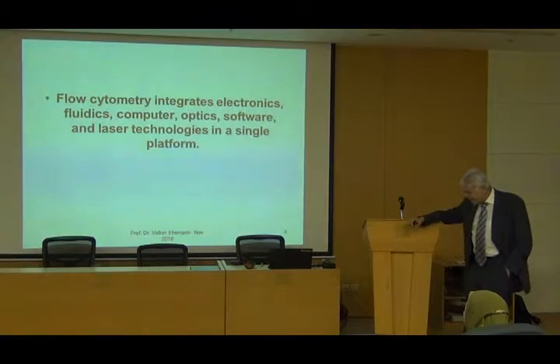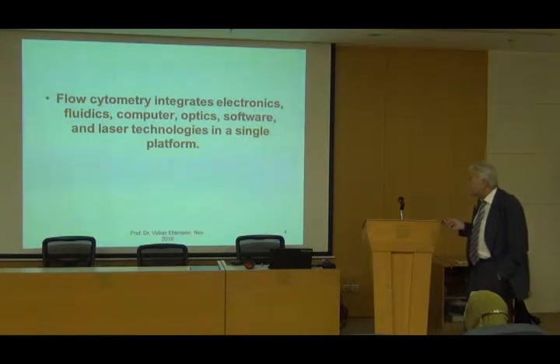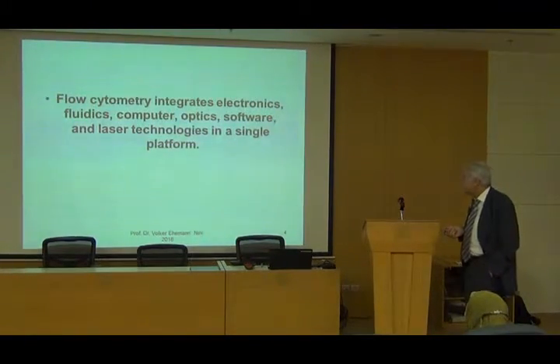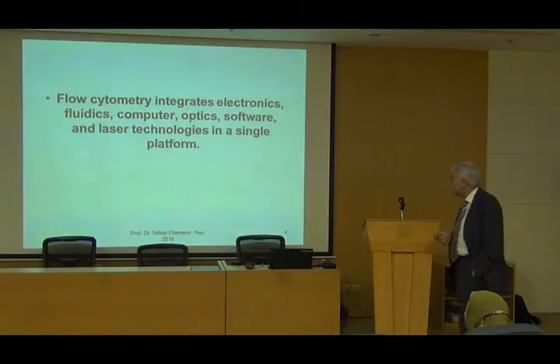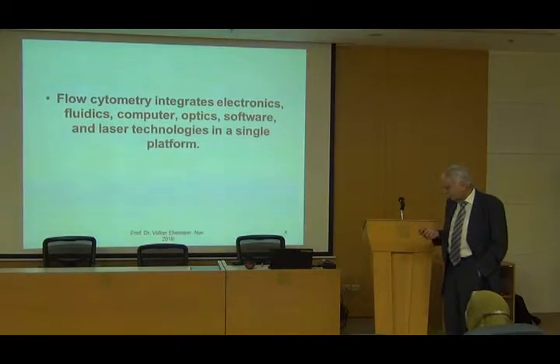Flow cytometry integrates electronics, fluidics, computer, optics, software, and laser technology in a single platform.